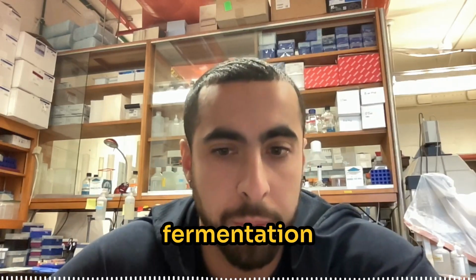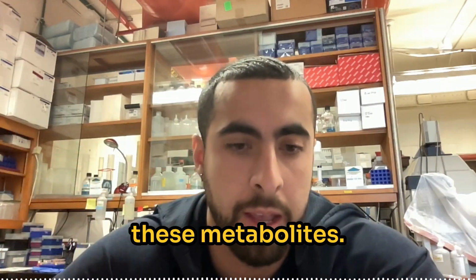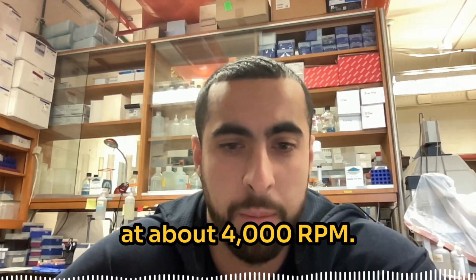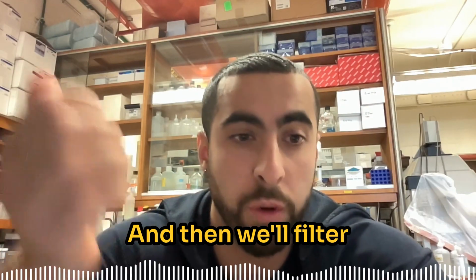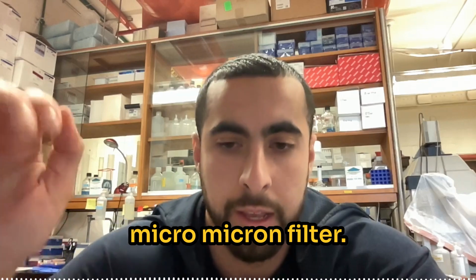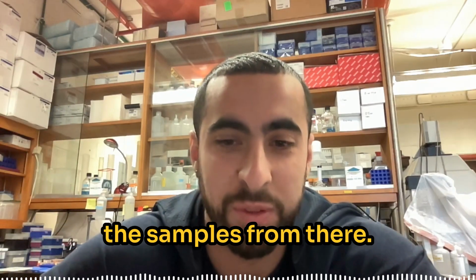And then after the fermentation process, these small communities produce these metabolites. And then we'll spin down the plate for about 20 to 30 minutes at about 4,000 RPM. And then we'll filter it out using a 0.22 micron filter. And then we're ready to rock, and we pretty much run the samples from there.